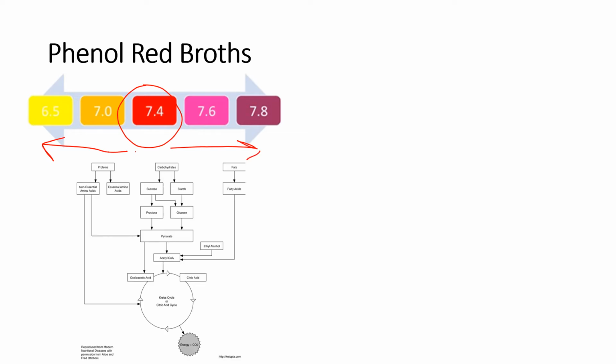And the pathway you are looking at are the different sugars like sucrose and glucose and some other sugars. So you are determining if the bacteria has the ability to break these sugars down to generate energy. And if they do, they will produce acidic byproducts. So if the bacteria can utilize the type of sugar you're testing for, then the pH should decrease as the acidic byproducts build up in the test tubes.